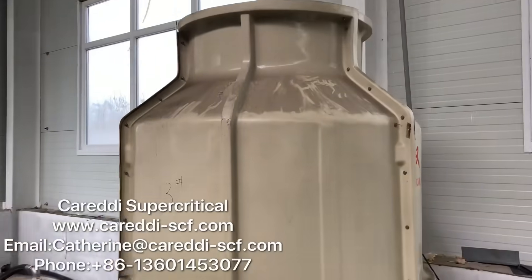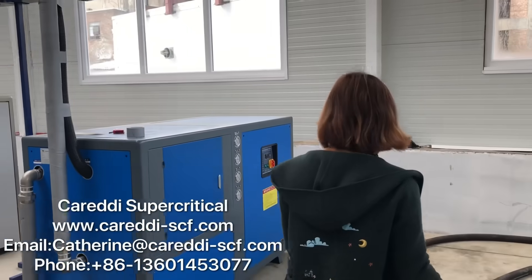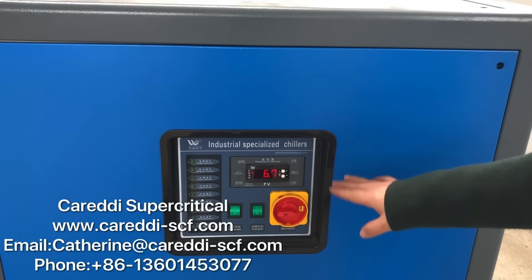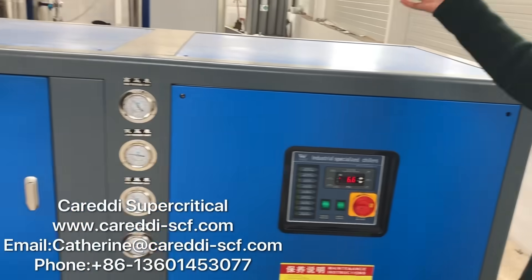This is the cooling tower. This is the chiller. It will work automatically to keep the temperature in the range between 2 to 6 degrees for cooling the CO2 gas.